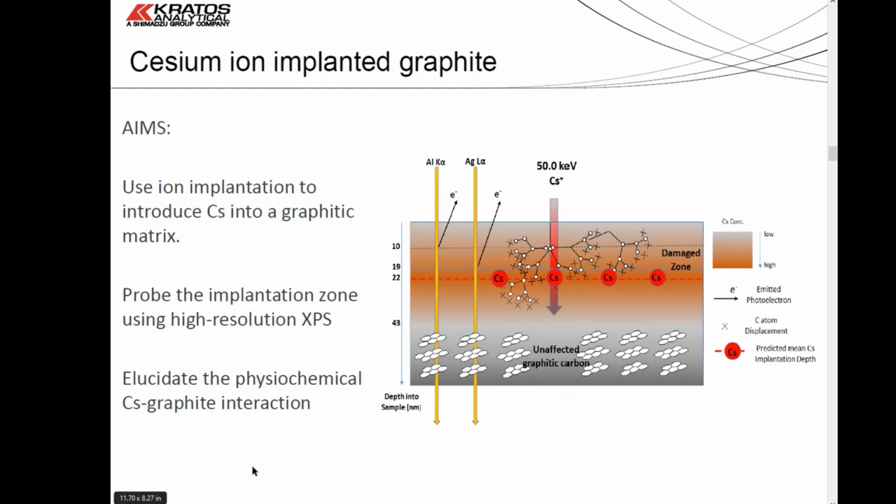But they can be optimized by trimming the size of the survey scan, or using the snapshot mode of the spectrometer as well, where instead of doing minute scans, you're analyzing in a location for maybe a second or two, especially on the bright lines or those elements that have a high concentration already. So there is a certain amount of optimization that you can go through as the analyst during the process.